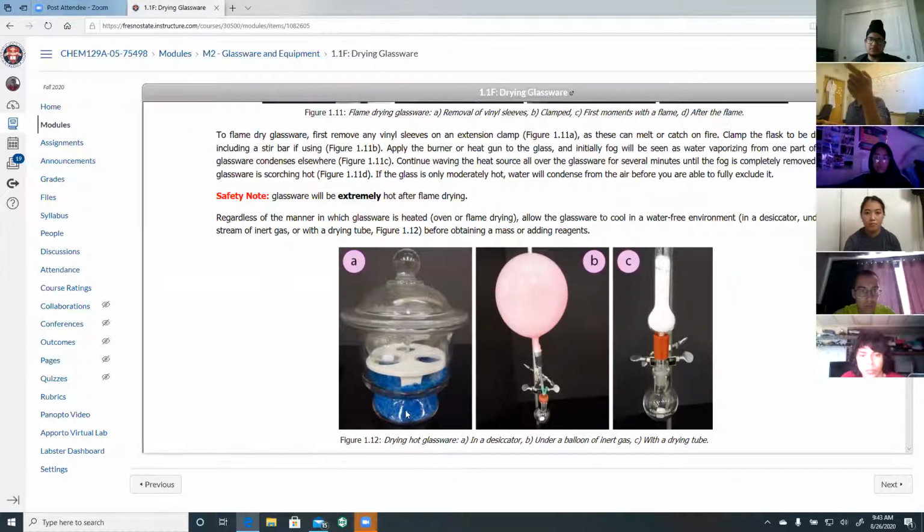So this is a desiccator, and it's pretty cool. It's not that you guys need it for this class. When it's blue, it's dry. When it soaks water from moisture from air, this whole thing turns pink. I think it's cobalt chloride or cobalt nitrate or some chemical. It's primarily calcium sulfate. It also makes things dry, but the indicator, the stuff that turns blue when it's dry and turns pink when it's wet, I believe it's cobalt something. I can't remember what it is. Cobalt sulfate, maybe.